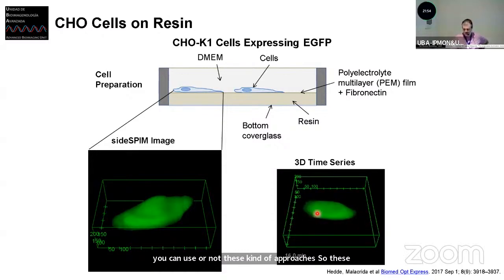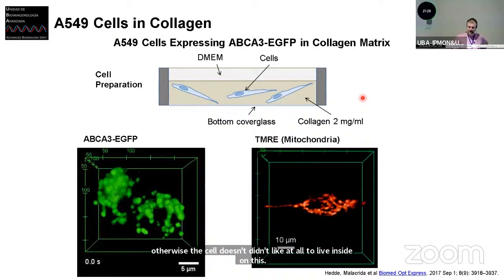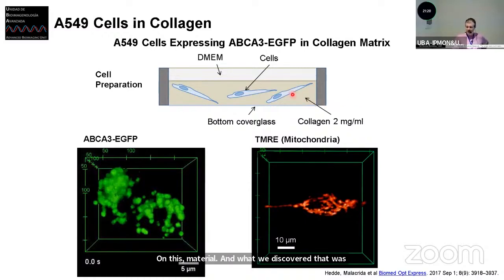And these are cells that are moving on top of the resin. We discovered that this resin was not that friendly with biology because it was very, very hydrophobic. And we started to put on top of the resin fibronectin, proteins that are part of the extracellular matrix, otherwise the cell didn't like to live on this material at all. And what we discovered that was very nice is that collagen has the same index of refraction as the medium where the cells were growing. And this is very nice because we can indeed do 3D cell culture, which is how in real life the cell lives inside the tissues.